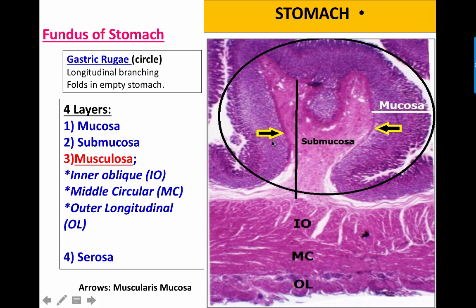The stomach wall is formed of the same four layers as the digestive tube: mucosa starting from the surface to the muscularis mucosa, then the submucosa (connective tissue) which extends into the folds, then the muscularis, and then the serosa. Here the muscularis is characterized by an additional inner oblique layer, anterior to the middle circular and outer longitudinal muscle layers.